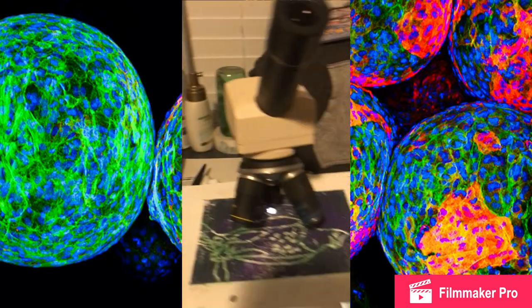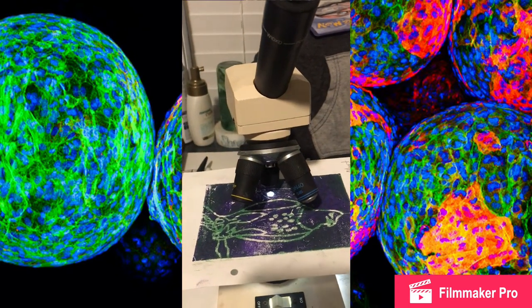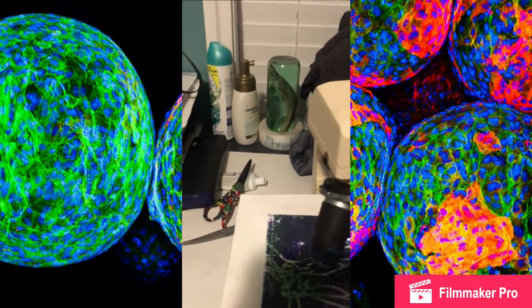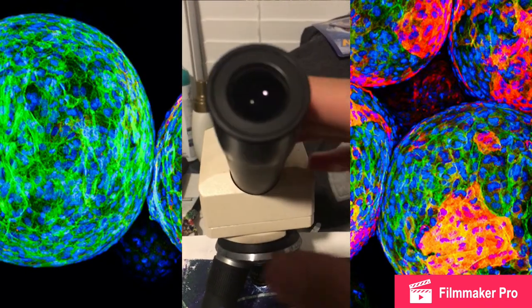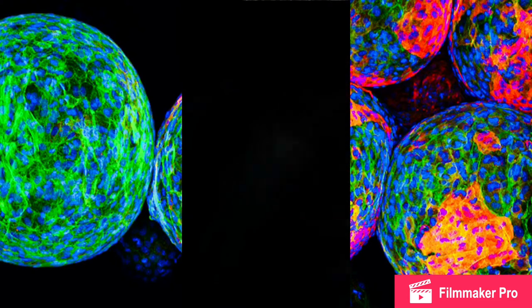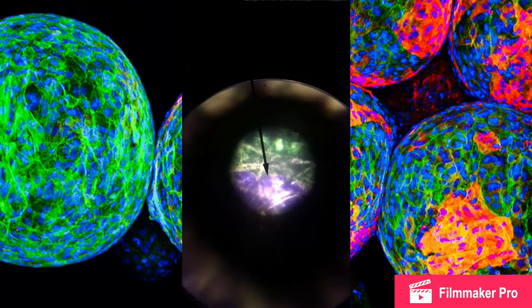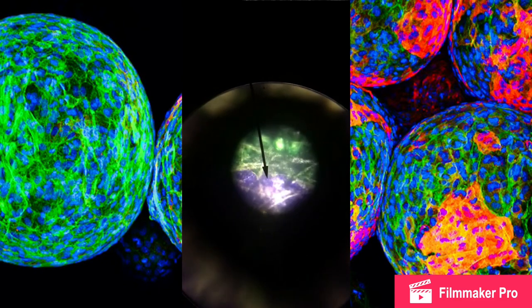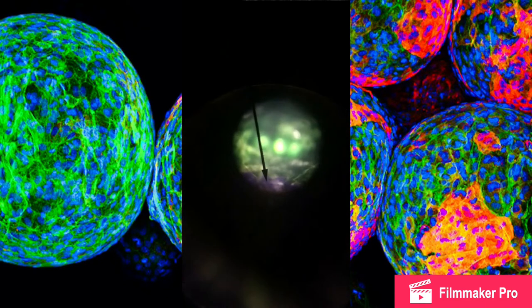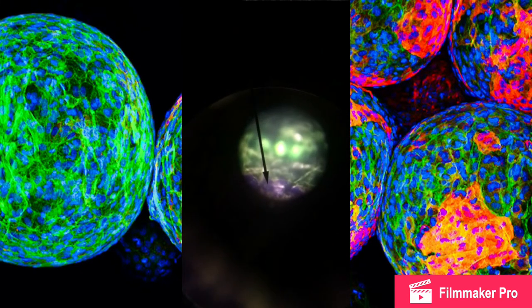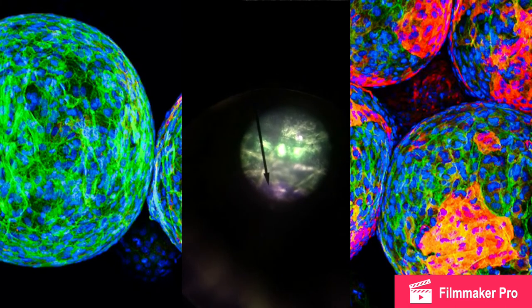Now I'm going to increase the magnification—I'm going to zoom in, technically. Let's see what it looks like again. Let me adjust it. That looks nice.